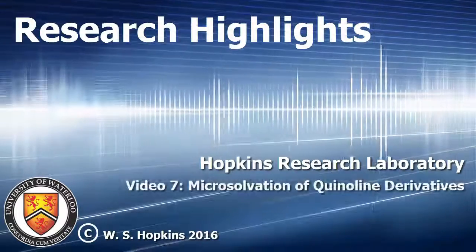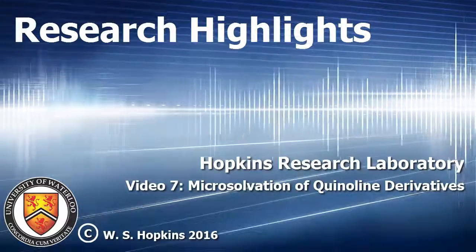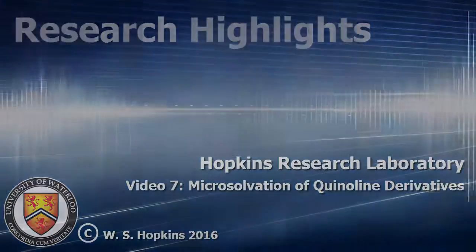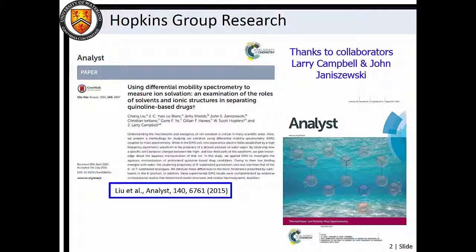This video highlights some of our recent progress towards using differential mobility spectrometry to assess ion microsolvation properties. For a more detailed discussion of how DMS can be used to determine ion solvent binding energies, please read our publication in the journal Analyst.